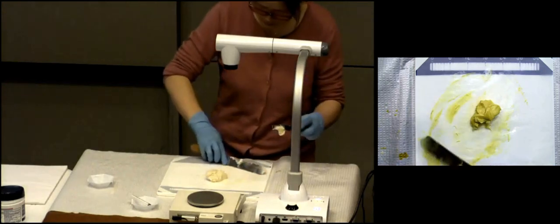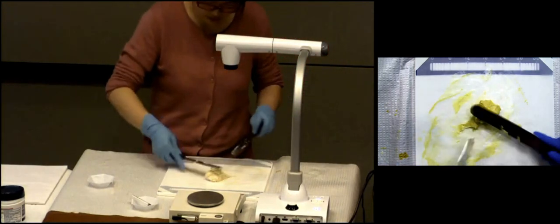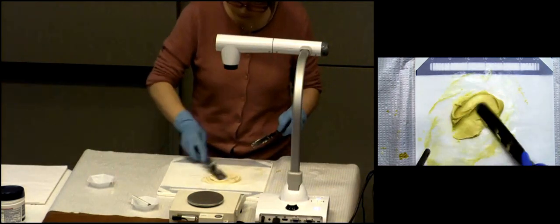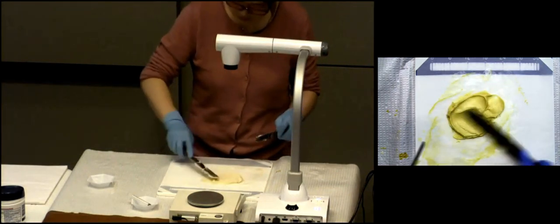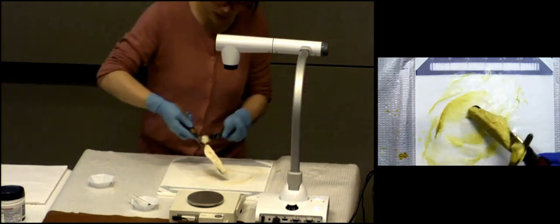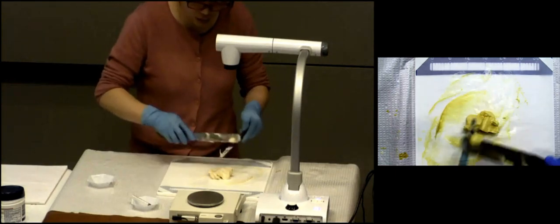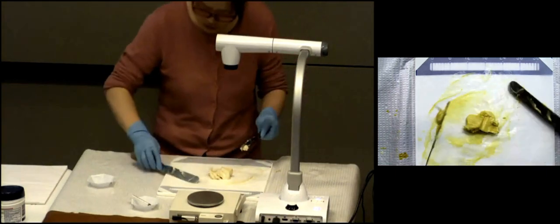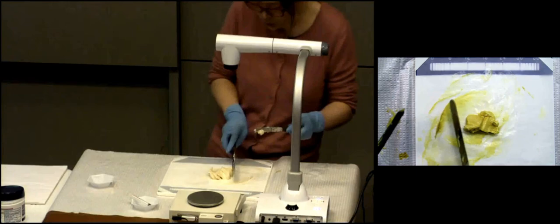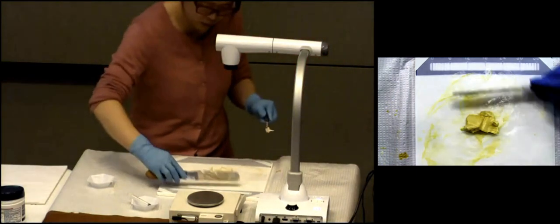And then down below that, Judy's going to show you here in a minute, you need to both clean the jar and dress the final product. So clean and dress were the key terms within those 2 steps as well. So don't leave those out of your procedure, for heaven's sake. All right, so let's gather everything together in the middle. We are ready to do the transfer, okay? And I literally want to gather everything together, and you know why I need to do this very soon, because it's possible that we may end up not having enough.